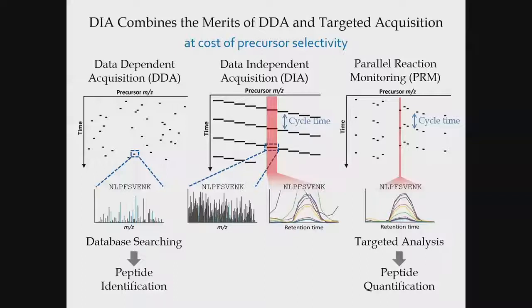And then you still analyze the data. At least from our perspective, we analyze the data in a targeted analysis where we have a target peptide of interest. We extract those individual chromatograms. We make decisions based on which peptides or which product ions don't have interferences in the actual data itself. We use the area under the product ions to determine the intensity. So that's, I think, a little bit the way we have approached it. We've always approached it this way. We've approached it as a comprehensive way of sampling the data with MSMS, where it's more analogous to parallel reaction monitoring, so we can go back and target or extract chromatograms after the fact.